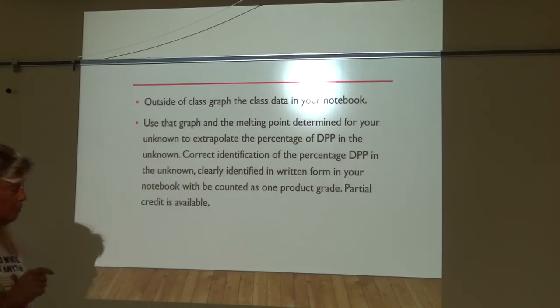Then, on the y-axis, you're going to mark where your unknown started and finished melting, read across, and extrapolate.